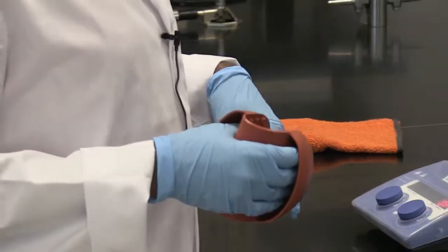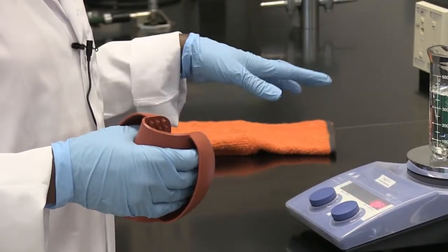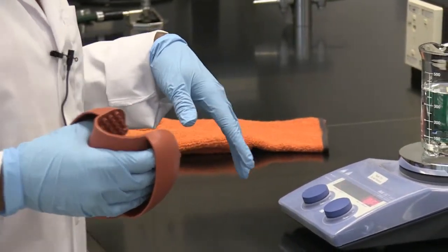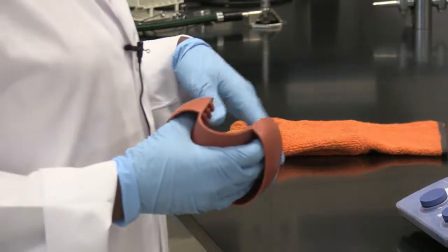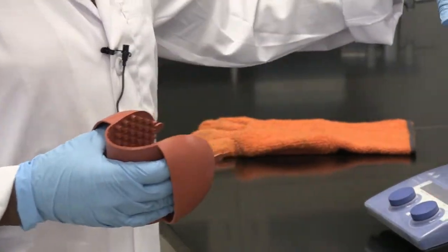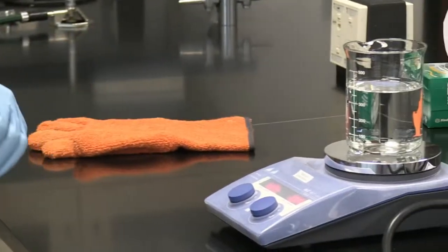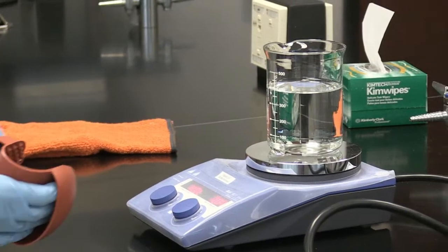After the water is placed on the hot plate for a while, it will get hot. Never hold the hot beaker with your bare hands because this will cause severe burns.